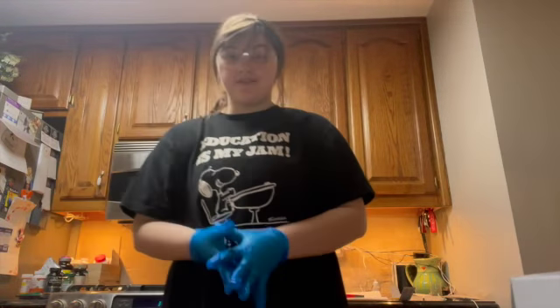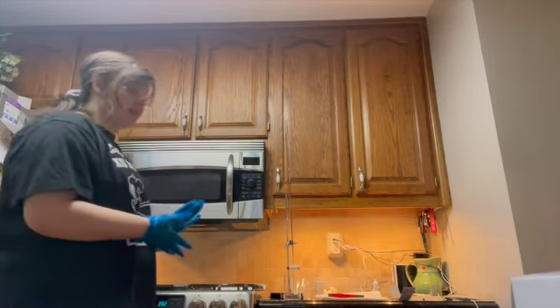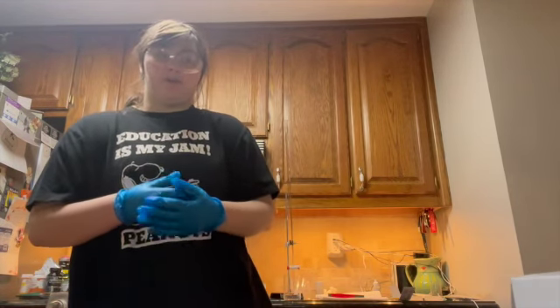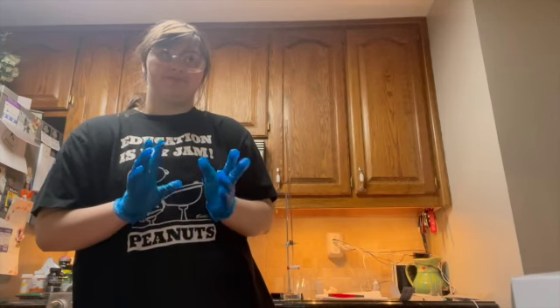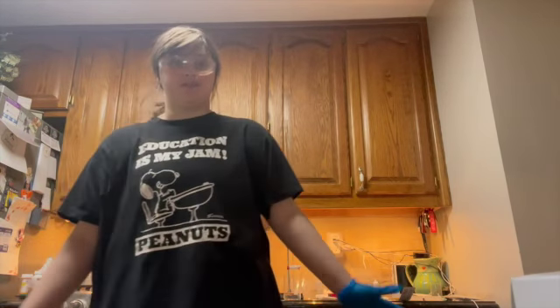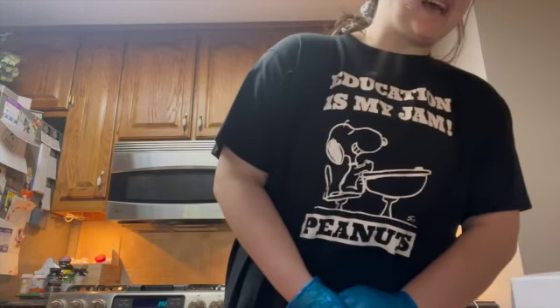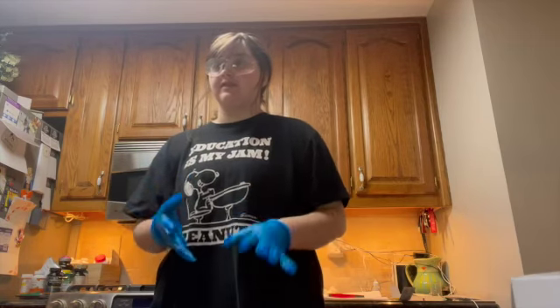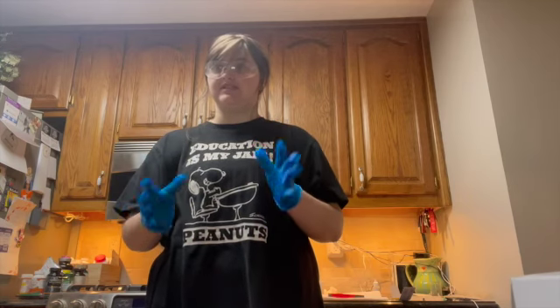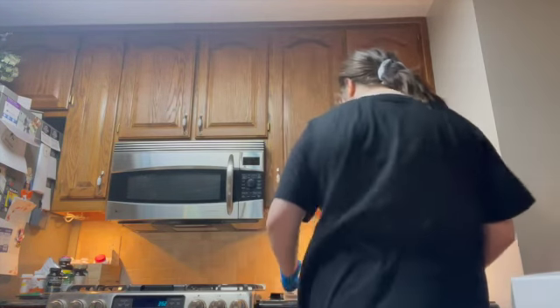Okay, so now we're back for trial 2, and I have put up everything, and I have checked its initial milliliters for how much of the titrant is in it, which is 0.0, and its pH at the very start, and that was at 3.5. So I made sure I recalibrated everything just to make sure that there wouldn't be any crazy differences. So let's start off with our first milliliter, and we'll get going.